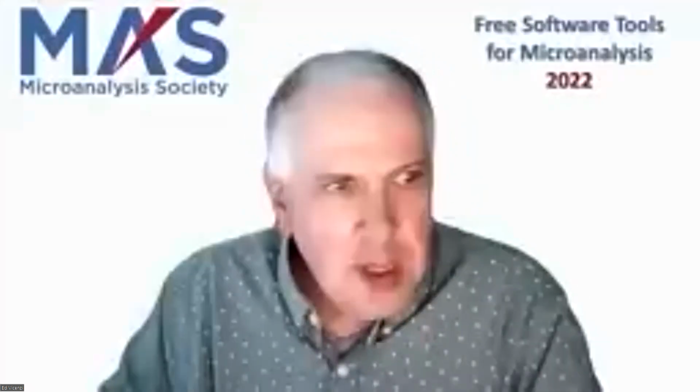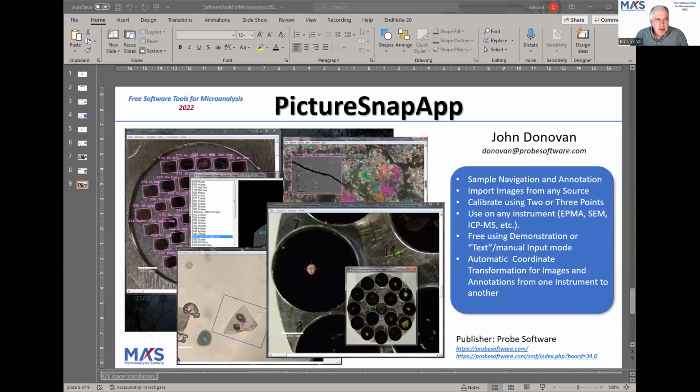Okay, so our final presentation today, we're going to bring back John Donovan, and he's going to speak to us about PictureSnapApp, an application for calibration, annotation, and navigation of sample images from any source on any instrument with an XYZ or XY stage translation.